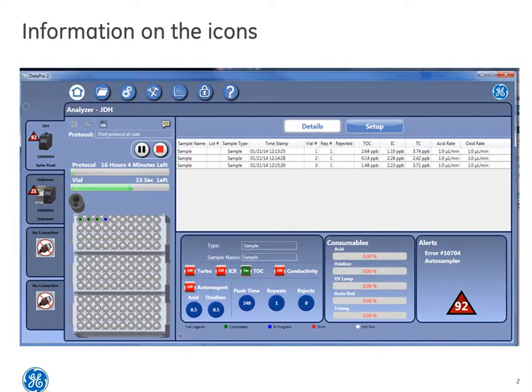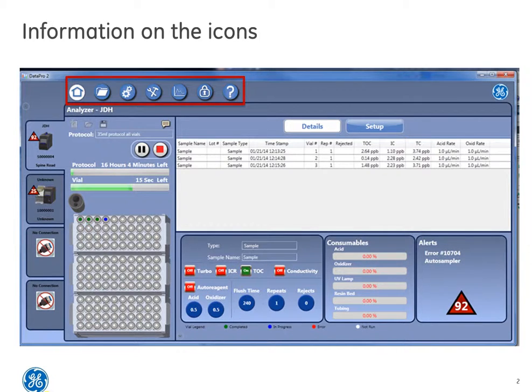This is our second part of the series that focuses on information around icons. In our last session, we went over the home screen that you see here. For this one, we thought we would provide you details on these icons at the top left of the home screen.